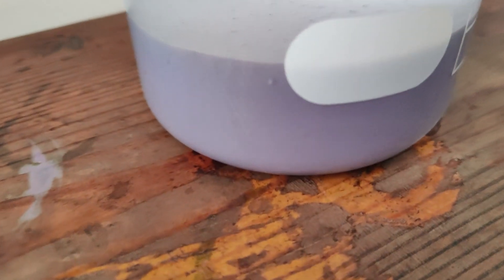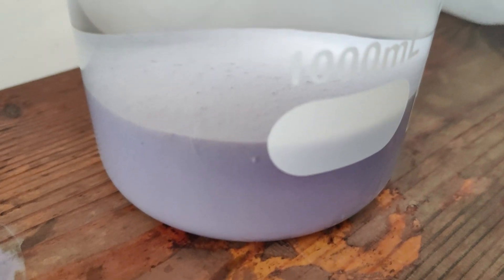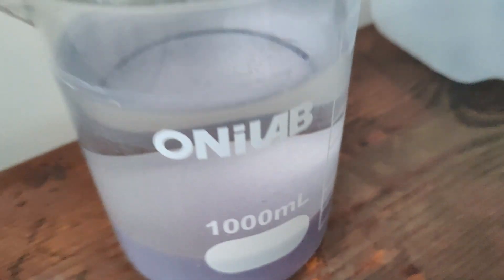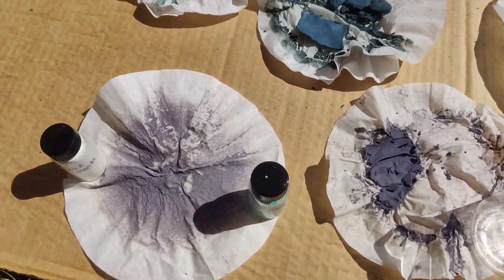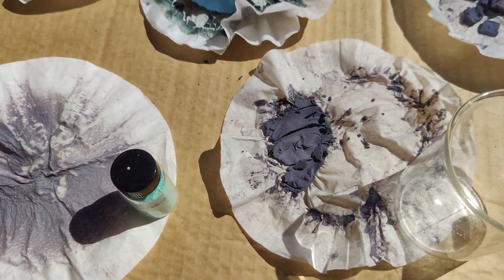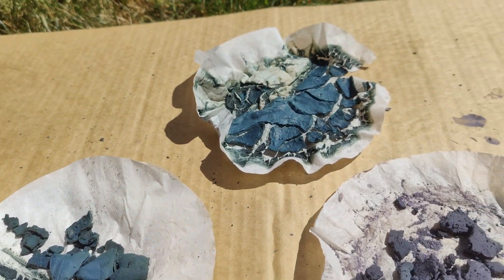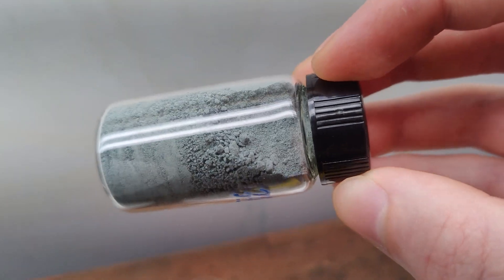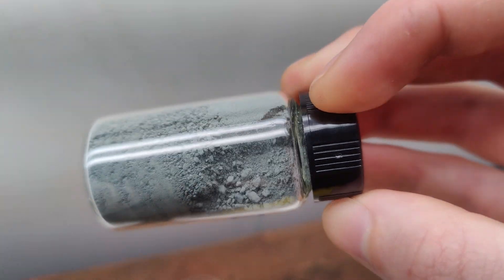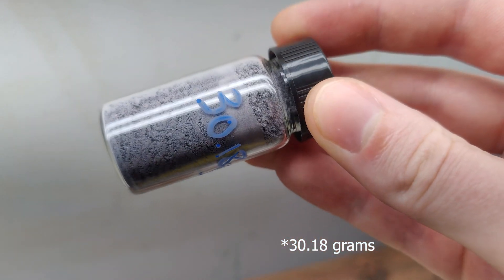I let everything sit overnight to settle, then decanted off the liquid containing my lithium hydroxide, and then filtered my hydroxide precipitate using lots of distilled water. At one point I also accidentally spilled a large portion of my purple precipitate. While I attempted to save what I could, I probably ended up losing about half of my total yield, which was a real bummer. I placed everything outside to dry in the sun, ground them up with a pestle and mortar, and stored them into some small glass bottles. My actual yield came up to 33.3 grams for the blue precipitate and 13.18 grams for the purple precipitate.